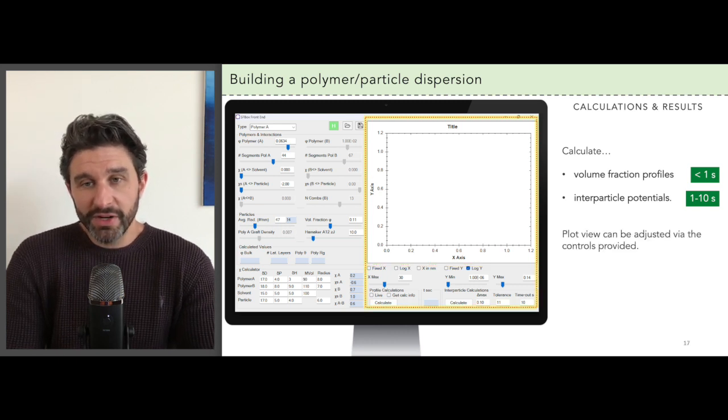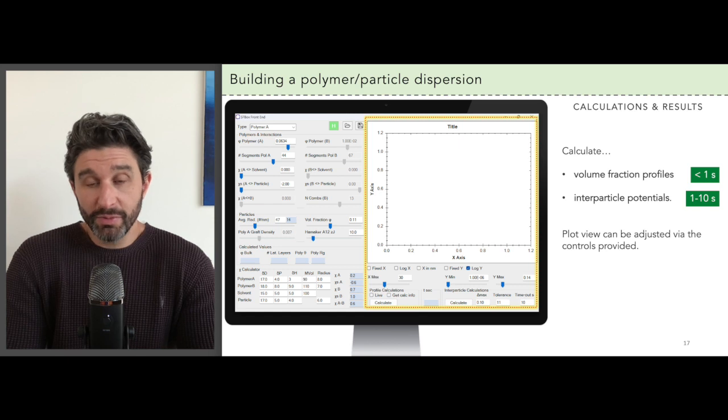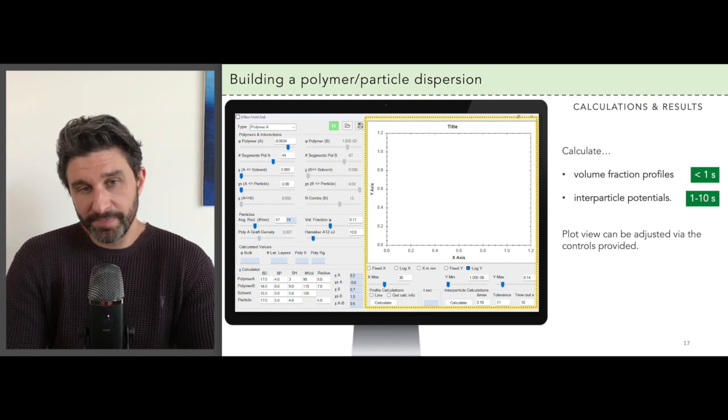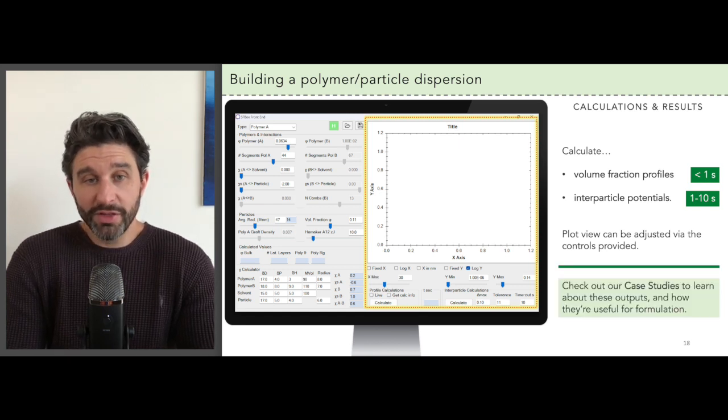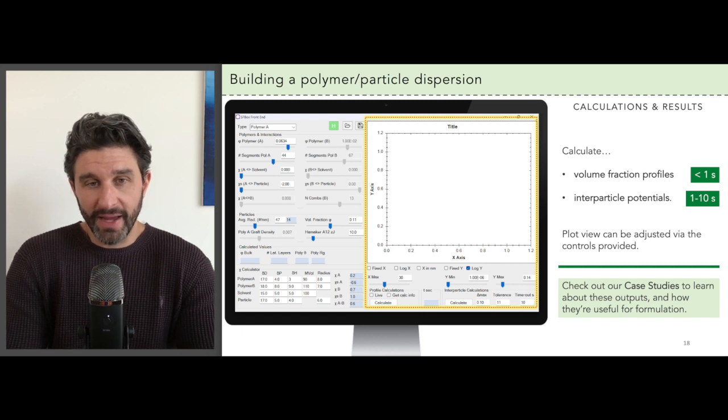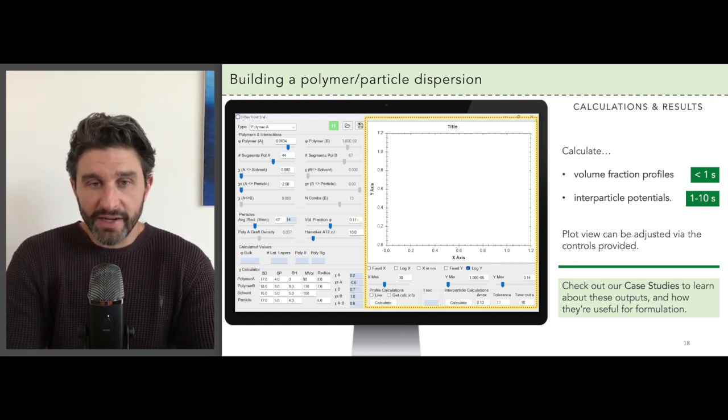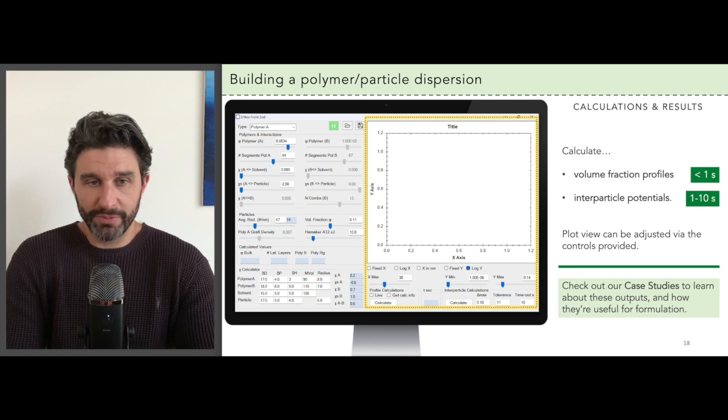Now as we mentioned before, you can also change the setup of the plot with the plot controls provided. But more importantly we'll walk you through a couple of case studies of applying this app to dispersion formulation so that you can get a clear idea of how to use the output from this in practice.